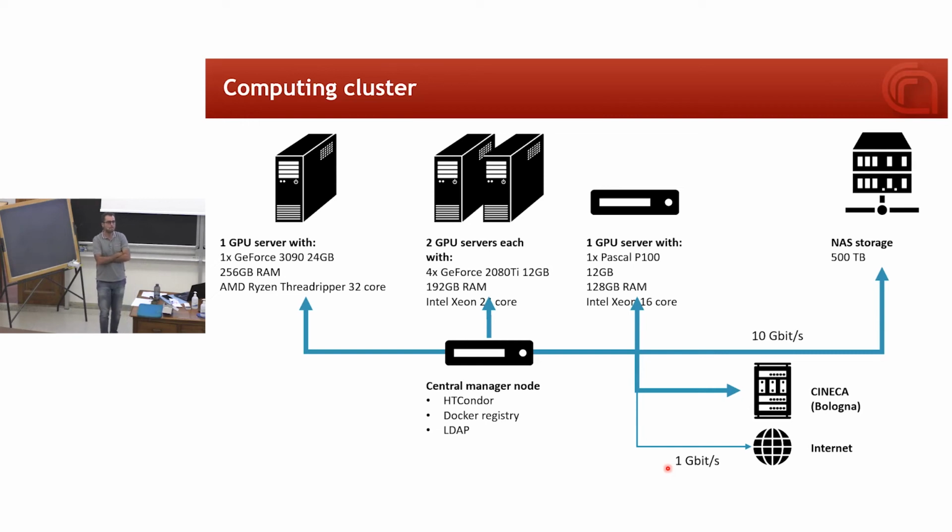True. And then we do all this, and then we segment neurons that have already been tagged, which should be the simplest computer segmentation ever. Tag them with a frequency dependent tag that says you have no neuron. We can scan at high resolution, but in the end it's just chunked into, at best, cells, which are sort of 50 micron-ish size objects, right? How much is 50 micron like size? 50 microns seems big, maybe less than that. No, so maybe, I don't know.